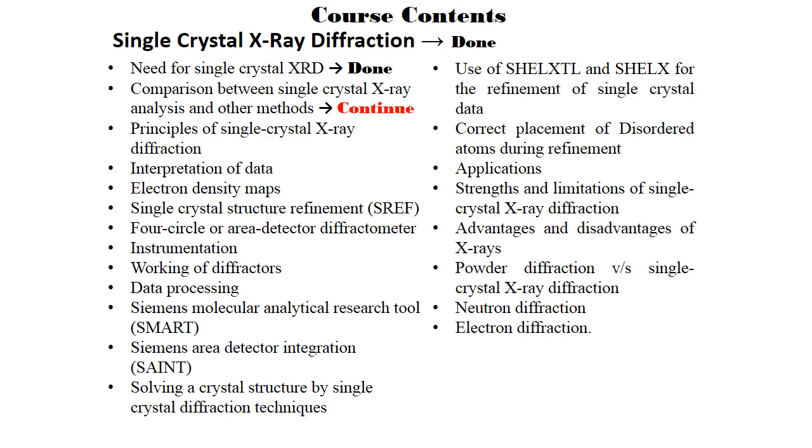This is also done before. Now in this topic we will discuss the comparison between single crystal X-ray analysis and other methods. This topic is continued, and we will also discuss the principles of X-ray diffraction.